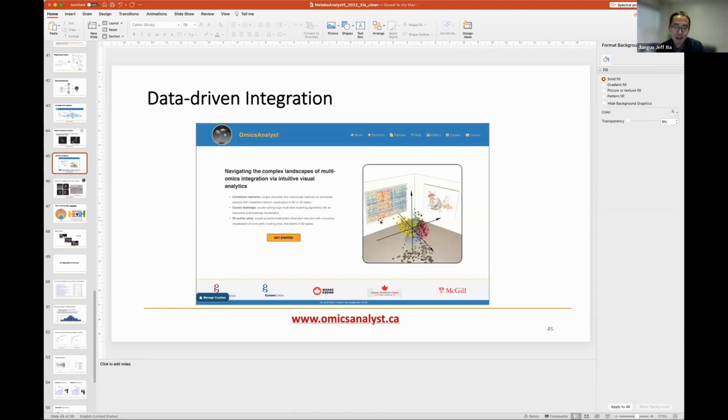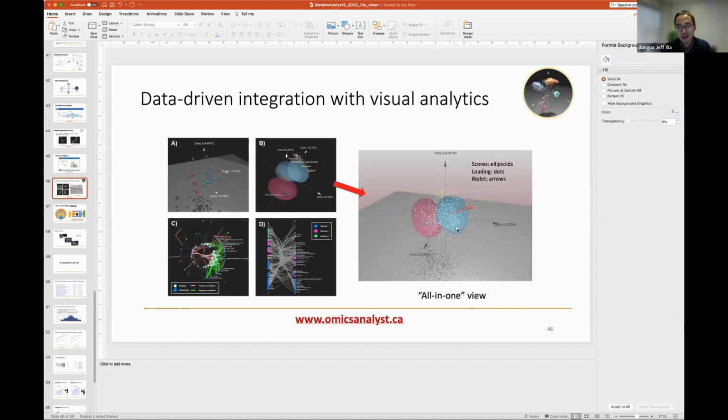And if you're talking about MINT and DIABLO, it is here, in OmicsAnalyst. You need to upload the data tables. It will use dimensionality reduction and projection, and DIABLO is one of them. Actually, we have 12 different methods for dimensionality reduction. So MINT and DIABLO are both there. We try our best to make it more visually appealing, because multi-omics, multivariate statistics is so hard, and we want to make it more easily digestible, just like this. This result is probably from DIABLO.